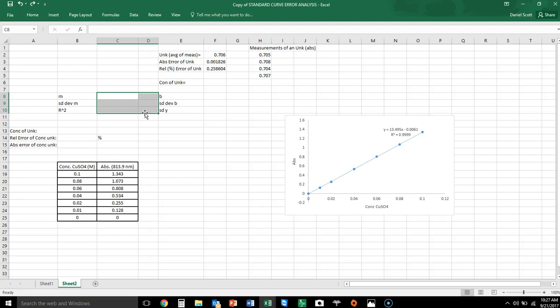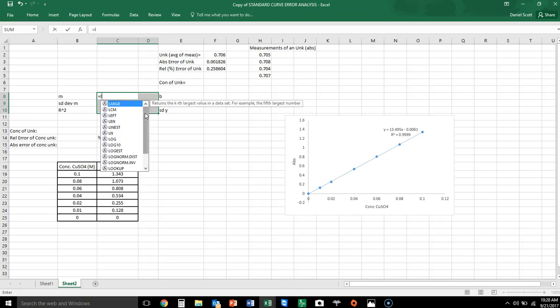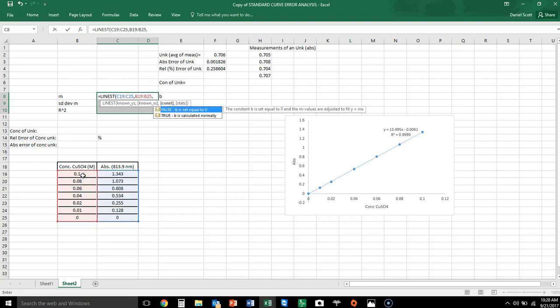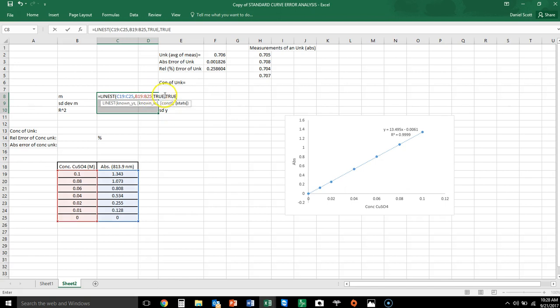It depends on the quality of the data. LINEST determines the quality of that data and gives you an error on the slope and on the y-axis. To use LINEST, I highlight a 2-by-3 array of six values, start typing LINEST and double-click it. It asks for the known y's first — my absorbance values — then a comma, and then the known x's, the concentration values.